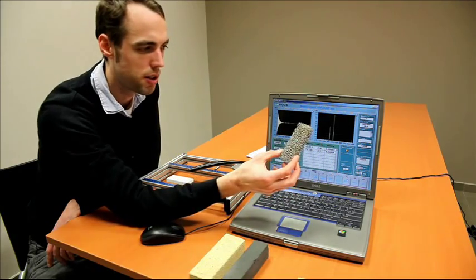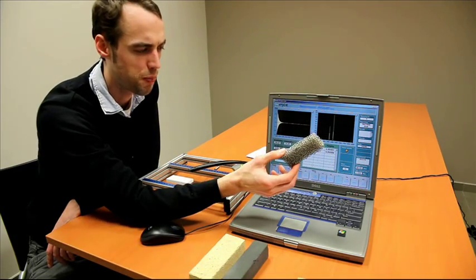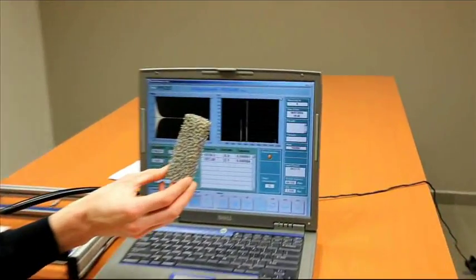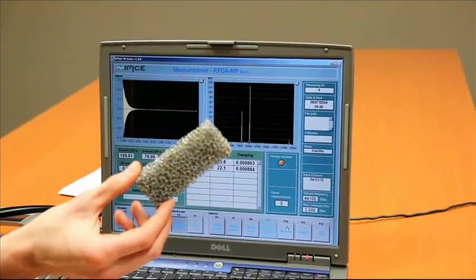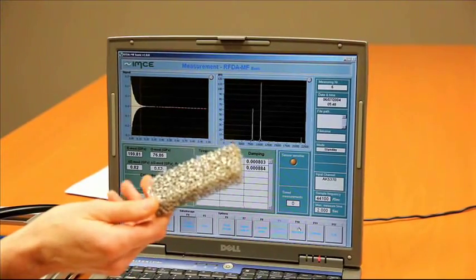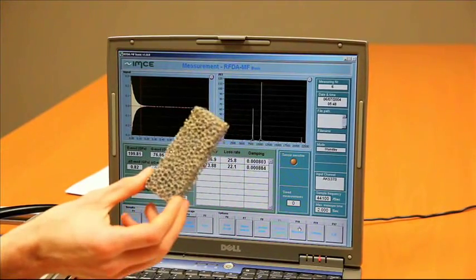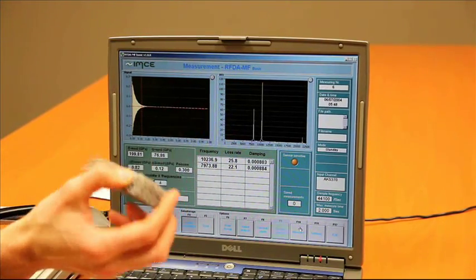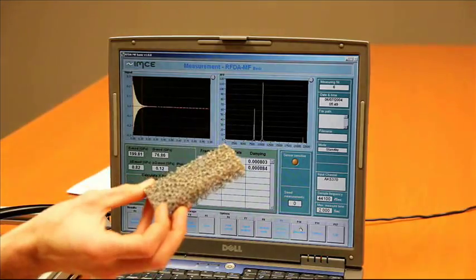Another example is this aluminum foam. Very porous material. Also possible to measure with this setup.